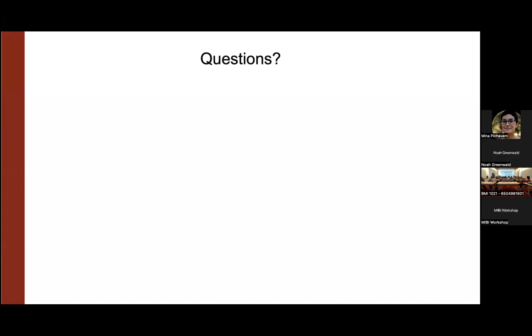Hi, Hadeesha. I had two questions. You mentioned at the end the 400 versus 800 FOV. Is that just a choice per project, or is that when you think there might be more architecture that you care about in each of your TMA cores, or what do you choose and why?